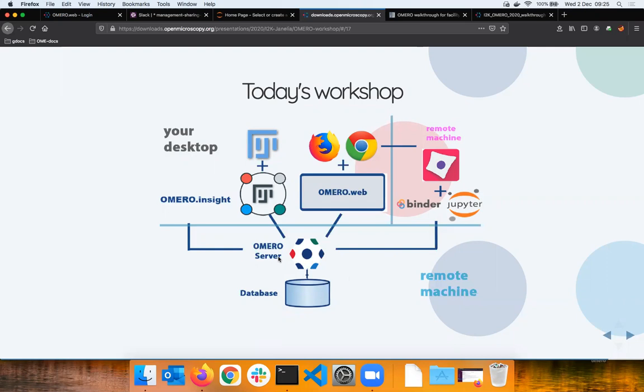That's the city I'm sitting in, but I'm not sitting with the server either. I'm sitting in my flat, which is somewhere in Dundee. The University of Dundee campus is down the hill there, and there is somewhere a building where the server which we are using is located. Its name is workshop. That's just for our convenience, and all our images are stored on that server, so they have been pre-imported there. Very good.